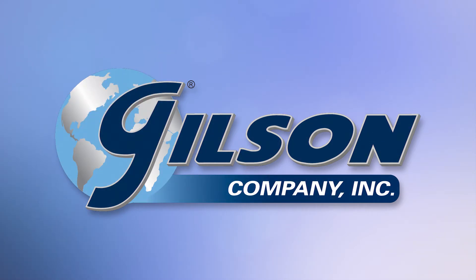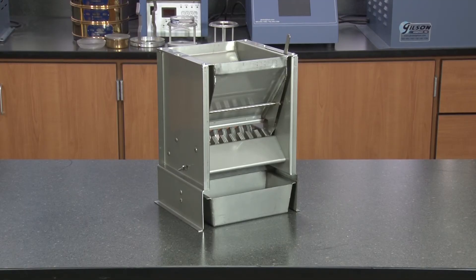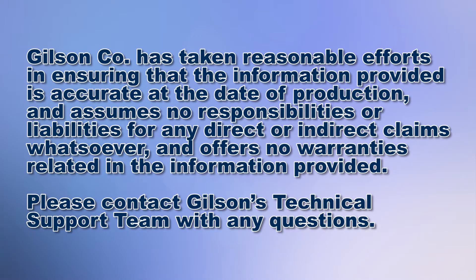Today we're going to demonstrate reducing bulk samples of fine aggregate to testing size using the Gilson SB33 Universal Mini Splitter, the smallest of Gilson's exclusive design universal splitters — a great choice for splitting powders and granular materials with a top size less than 1/4 inch.